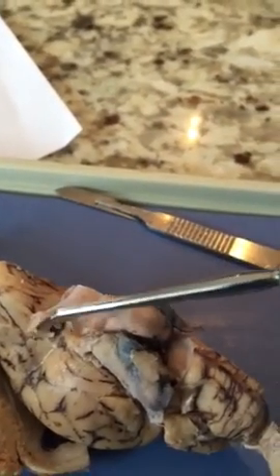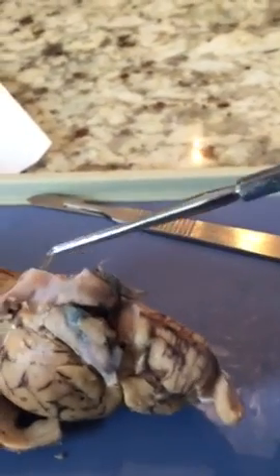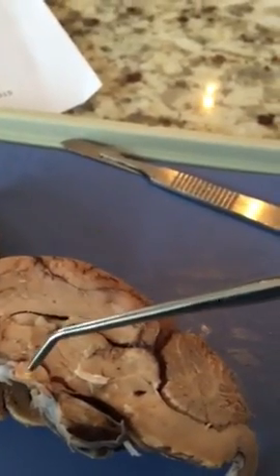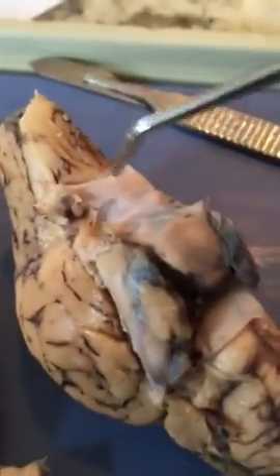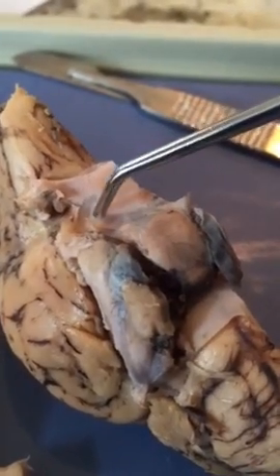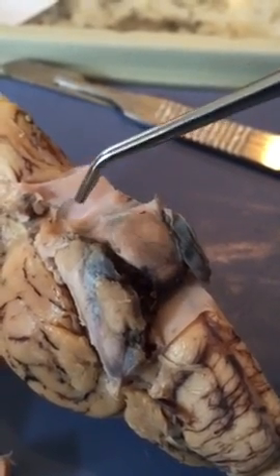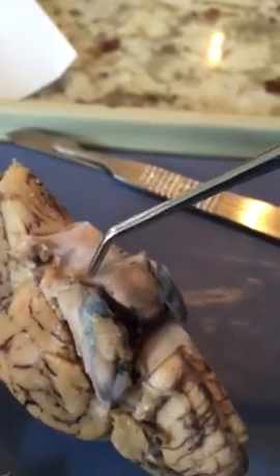The optic nerve is right here. The optic chiasm is located right here, where I've actually cut through it. The optic tract is located behind the chiasm, coming back. If there was one over here, it'd be going this way, but it's going backwards. So it's nerve, chiasm, optic tract. The oculomotor is located right in here.